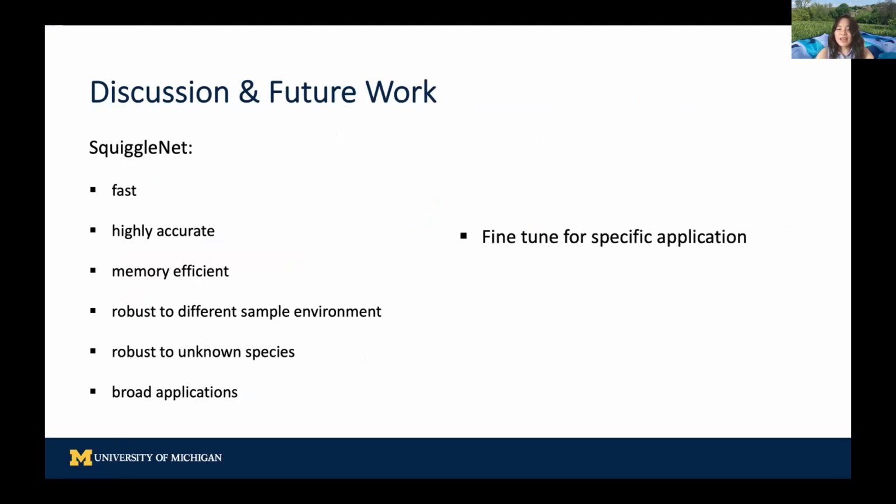For future application of SquiggleNet, it is highly recommended to retrain or at least fine-tune on the specific data set or experimental setting you're working with to achieve optimal results. As mentioned earlier, there's also larger room for optimization in streamlining the whole procedure to achieve even shorter runtime and save the time and resources for downstream analysis only on the targeted reads.